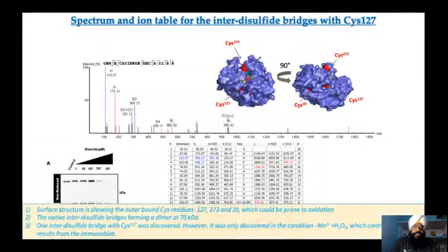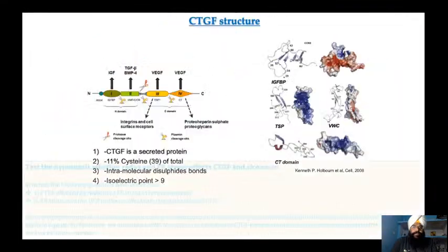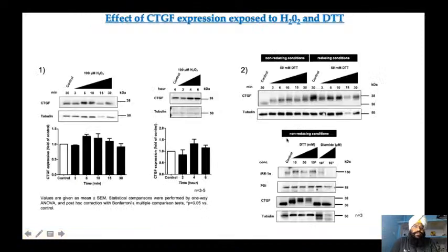This is not related to you. It is my mass spectrometry data for my PhD. In this one I ran some non-failing hearts, ischemic hearts, dilated cardiomyopathy with the control samples, and I could see some nice results there, with the dilated cardiomyopathy having lots of CTGF protein present, whereas the non-failing have less. So we can say that CTGF is highly present in the failing samples.